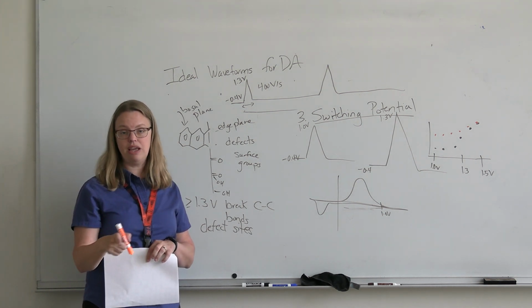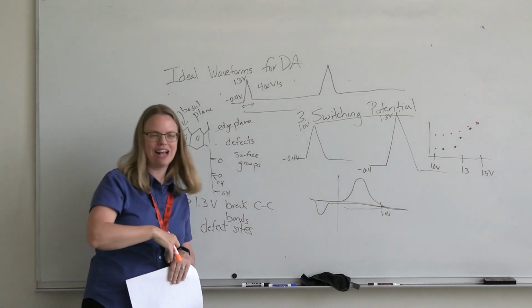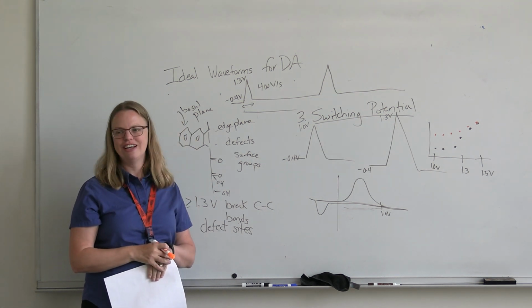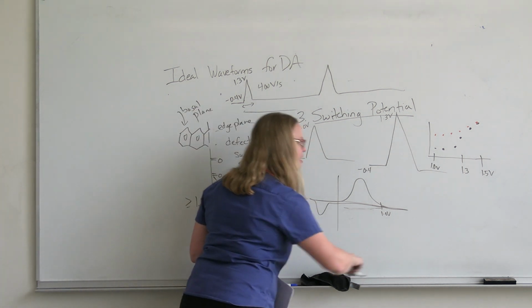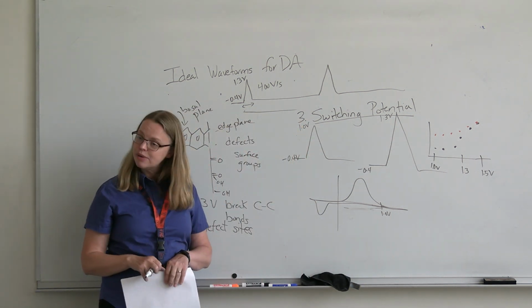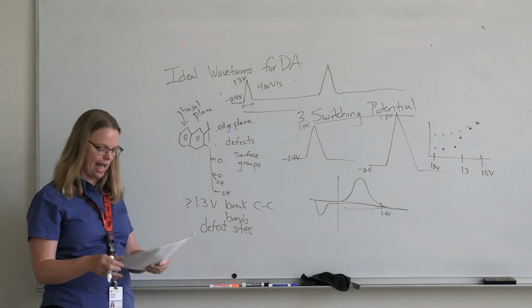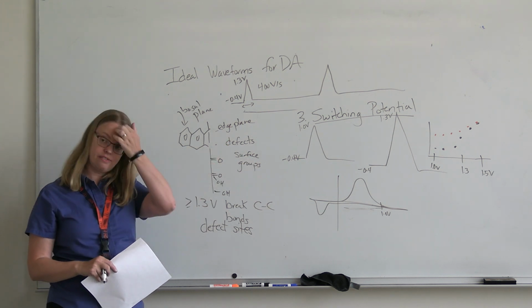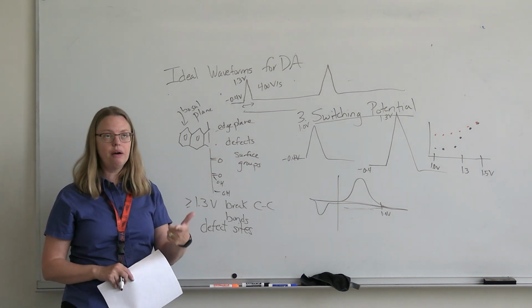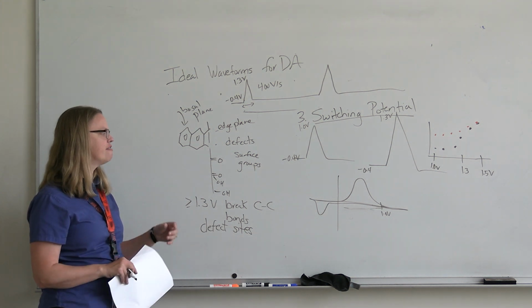Same thing with scan rate. A screaming fast scan rate activates the surface, and if you go back down, the surface does not look the same. So these experiments are directional because your electrode remembers that it has an activated surface. Once you activate a surface, you can't go back. Now almost everybody likes to work at this activated surface. It helps with fouling and with renewing the surface.